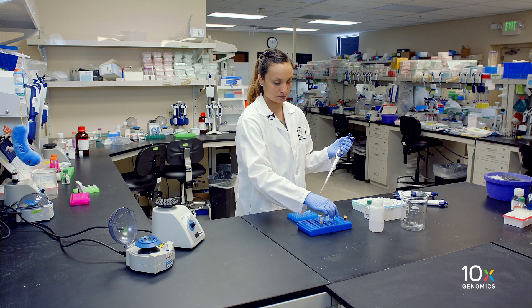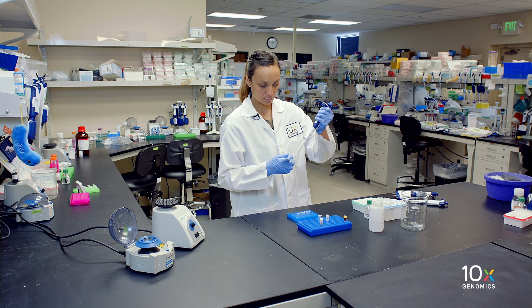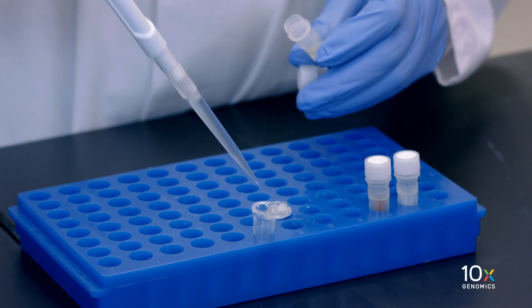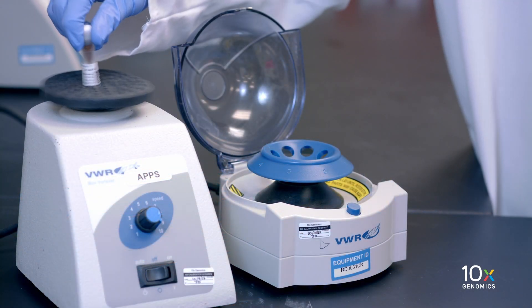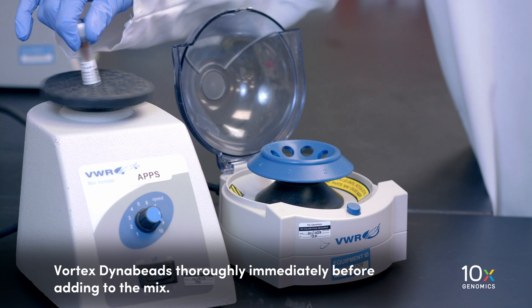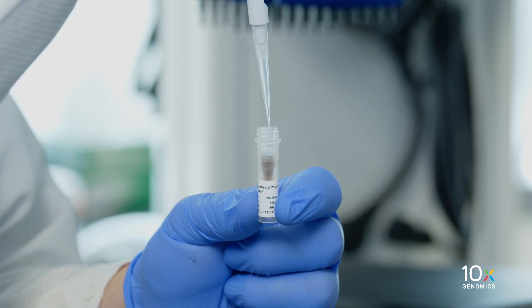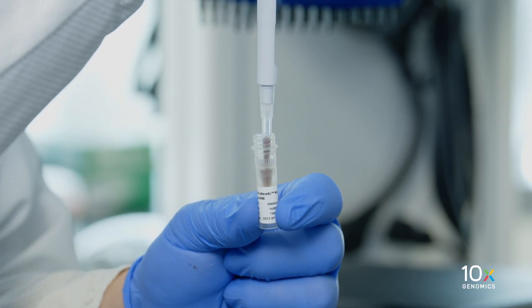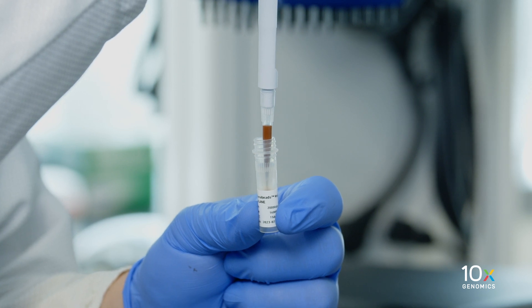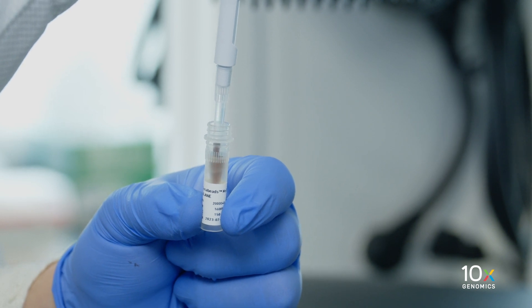We're ready to prepare our DynaBead cleanup mix by adding the reagents in the order shown in the user guide. Calculate the volume of each reagent needed for your number of samples, including 10% reagent volume overage. First, we add the cleanup buffer. Next, vortex the DynaBeads for 30 seconds to resuspend them — vortex thoroughly immediately before adding to the mix. Aspirate the full liquid volume in the DynaBead tube to verify that the beads have not settled. If clumps are present, pipette mix to resuspend completely. Do not centrifuge before adding to the mix.